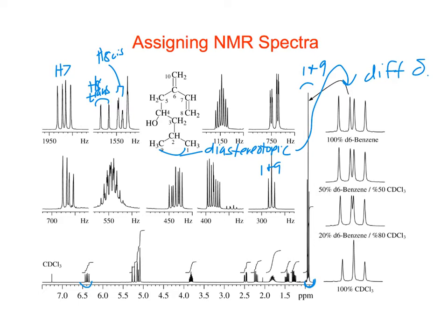Okay, and then what about the other double bond protons? We have H10 as well. So what kind of patterns would we expect H10 to be? They're geminal, right? And so how does that influence their coupling constant? Is it geminal coupling? Is it small or big? It's small, yeah. So I think we're going to see those mostly as being singlets almost.